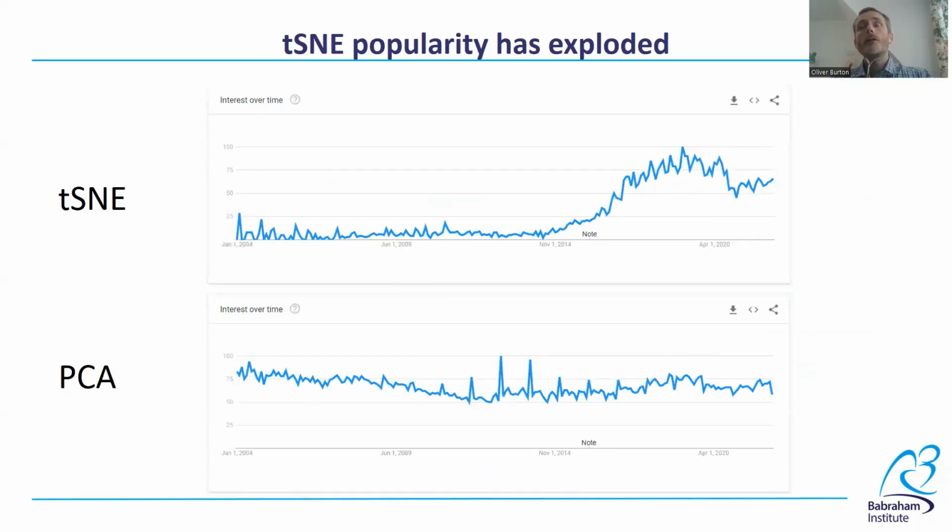Today, I'm going to talk to you about tSNE. tSNE is a data visualization tool that takes multidimensional data, such as high-parameter data from flow cytometry or single-cell RNA sequencing, and plots it in 2 dimensions. It first splats that data out randomly, and then tries to push and pull the data until the similar data points are together, and the structure is more close to the original structure in many dimensions.